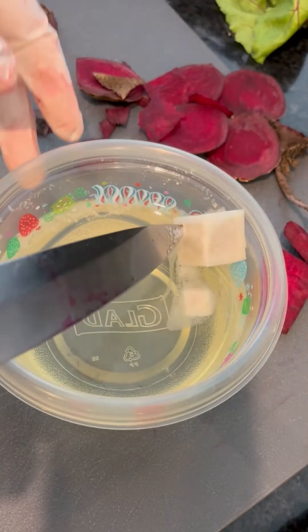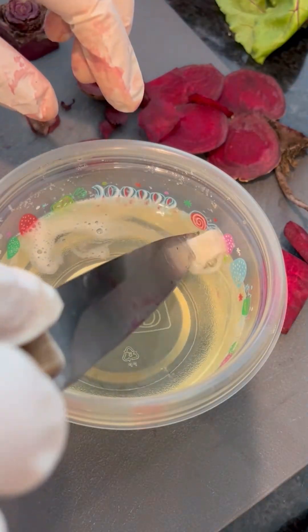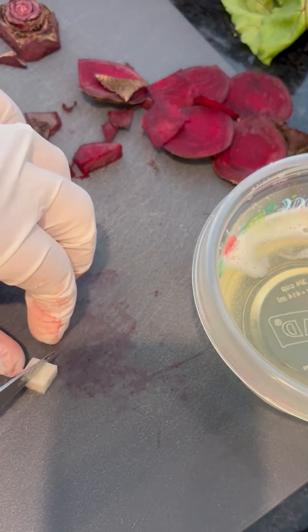After about an hour and a half we're going to pull them out. You can see that they are discolored from the bleach, and we're going to cut those both in half to see how far that discoloration has extended through each of the cubes.